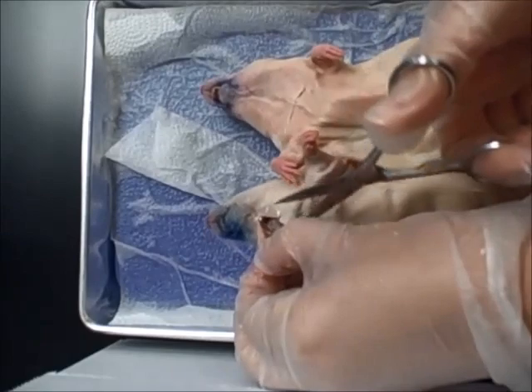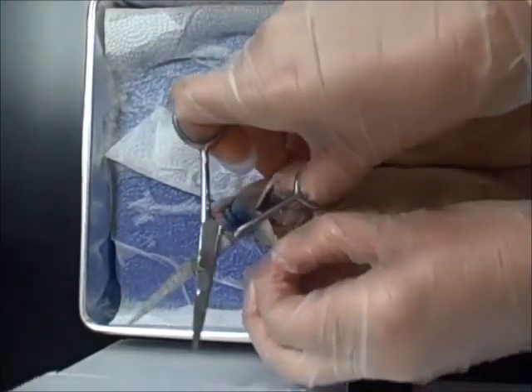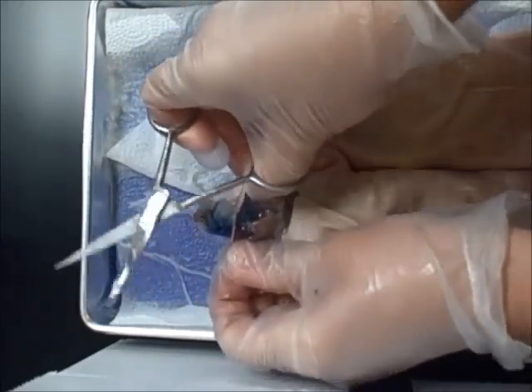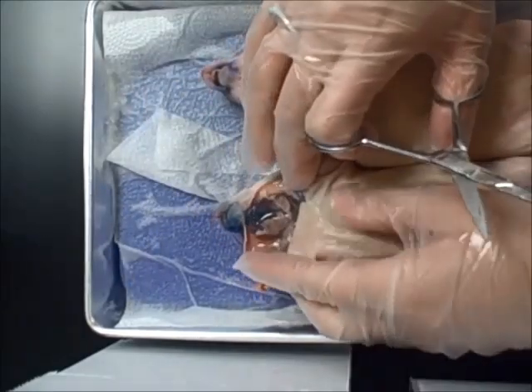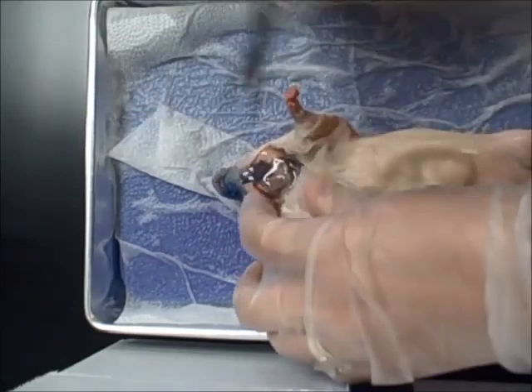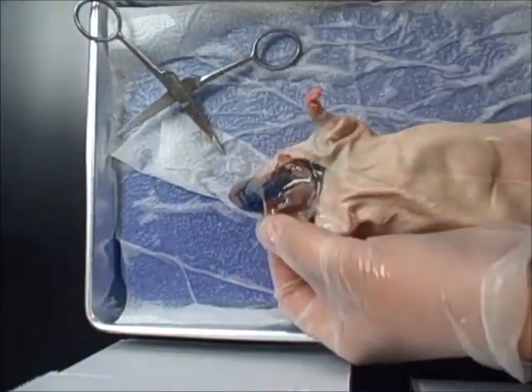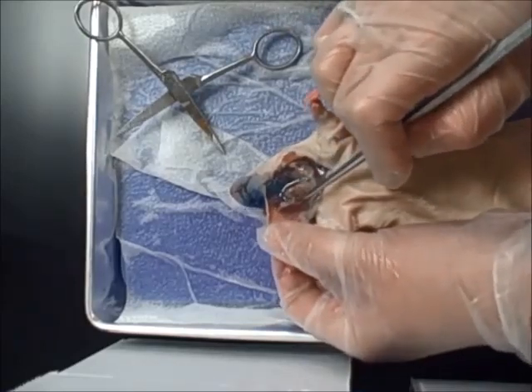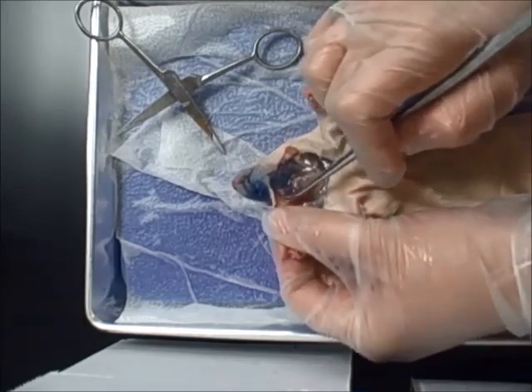Cutting up into the oral cavity. And the pink and blue that you'll see is latex injections so that you can see the arteries and veins. As we open up the oral cavity, you can see the salivary glands. So salivary gland 1, 2. You also can see some lymph nodes. And then there's also some tear ducts.